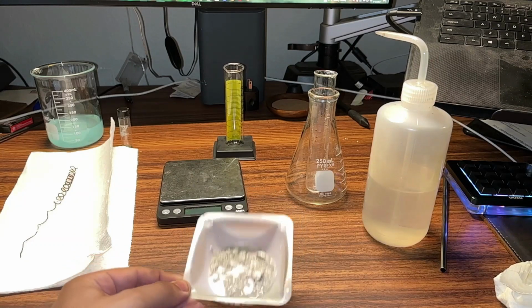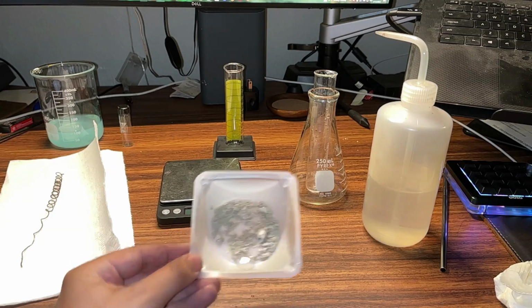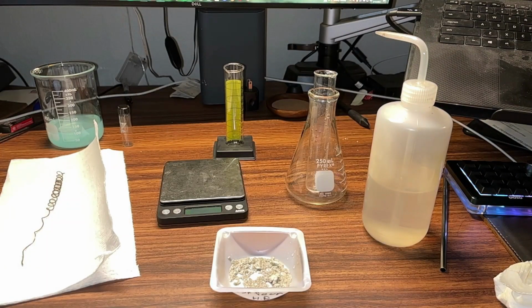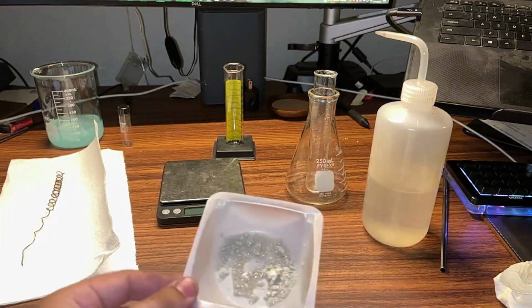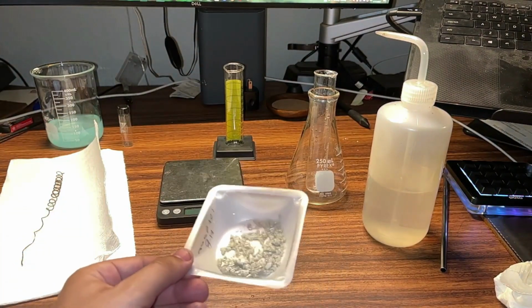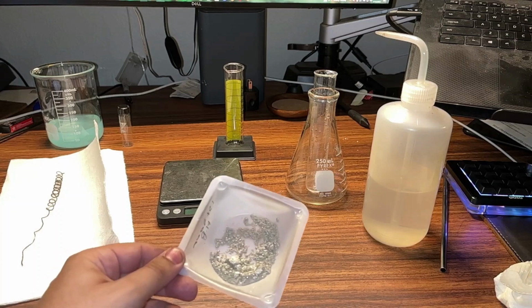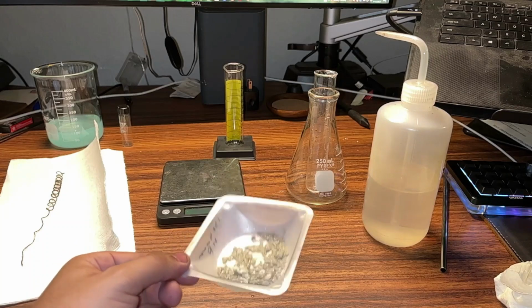And there we go. So, we are not completely done, because there's still some water in there. So I can't plop this on the balance just yet to figure out how much silver I actually made. I have to wait for that water to evaporate. And there's some tricks I can do here to make that go faster. Your classmates will leave it overnight, and we're not going to know how much silver we made as a class until Friday, when all the water has had a chance to evaporate. Okay, so there's that.